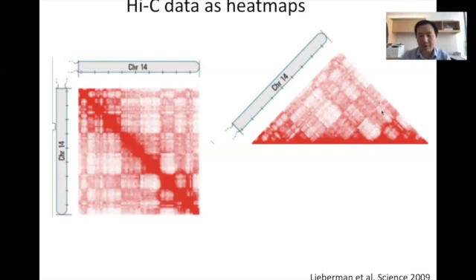Initially, I took this for granted, and then later on some people asked me what the dot stands for. Okay, in this triangle-like structure, the dot means the interaction between this region and this region, and you can begin to add your favorite genome browser shots here, right? So you can directly link the genes or your histone modification ChIP-seqs with chromatin interactions on the genome.